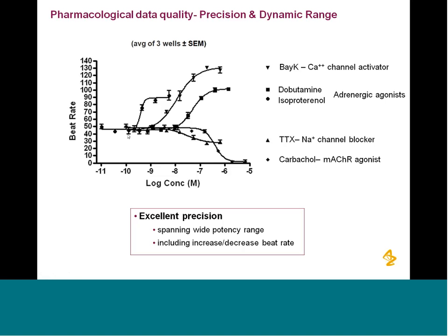So since that was so consistent, we have adopted, like Liang had, normalizing to time 0 and then normalizing again to percent of DMSO time matched control. So in future slides, you won't see rate proper, you'll see percent of control.